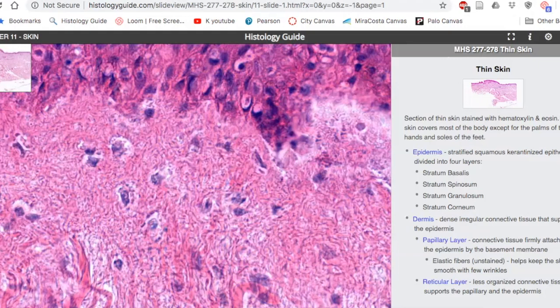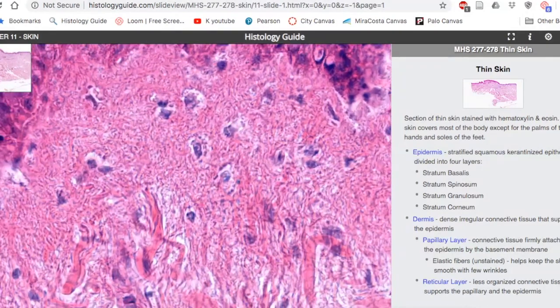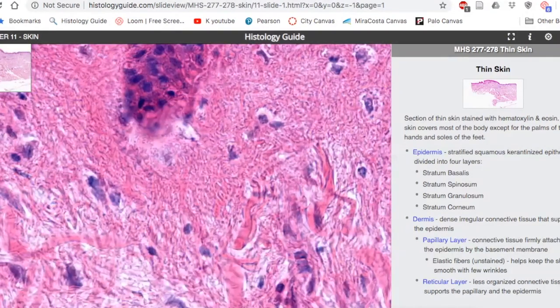They produce collagen, they produce elastin. So they produce the substances that create the ground substance, like those proteoglycans and stuff. So these guys are just sitting there spitting out collagen and elastin and whatever. They produce the matrix. That's their function. You'll go to the lecture, you'll see there are some other cell types in here, but you can't really recognize them in any of the samples that we have. So if I'm asking you what the cell is, your answer is fibroblast, okay?